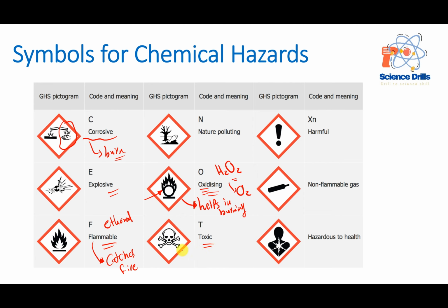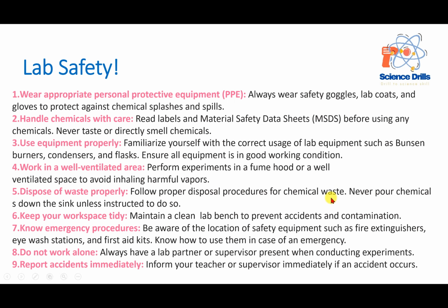And for a toxic substance you can find a skull and bones, and this is harmful. So you can memorize these symbols easily. And now go to the lab safety. These rules are not suggestions. Pause the video and try to read this.